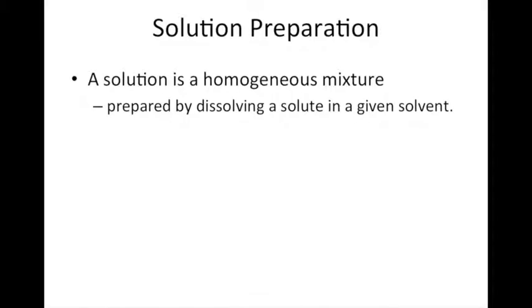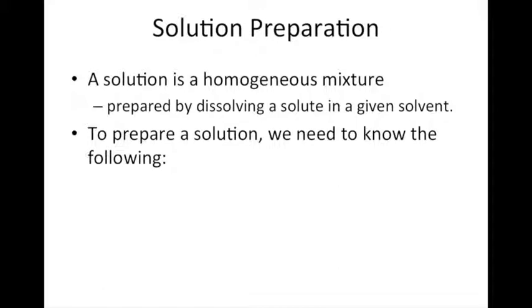In this video, we're going to look at the proper way to prepare a solution. A solution, of course, is a homogeneous mixture that's prepared by dissolving some solute in a given solvent. To prepare a solution, we need to know a few things.